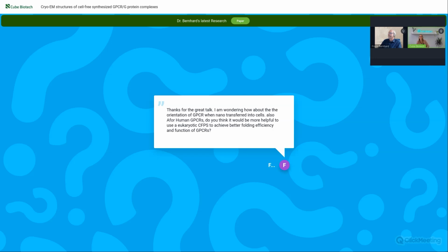Yeah, the next question I will just read for now. It will not appear on the screen due to some technical reasons. It is known that the Gq/11 class of G proteins is difficult to express and usually requires the chaperone Ric-8A. Have you tried the cell-free synthesis of Gq-coupled receptors, and was it successful in getting a cryo-EM structure of the complex? No, the only structures we have up to now, I have shown you. We are working on other ones.